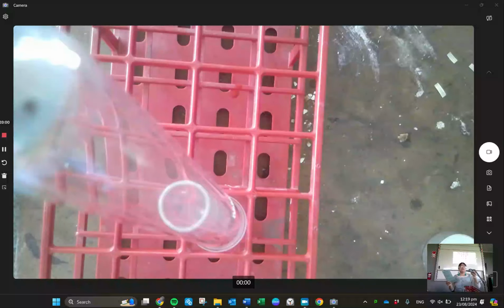So basically we have to figure out, is this hydrogen gas that's being formed, or is this sulfur dioxide being formed? Now, something to keep in mind is hydrogen's flammable. So if this pops, I know it must be hydrogen. If it doesn't pop, then it's sulfur dioxide. Do we see that thought process? I know it's not listed on the sheet, but it is. There we go. You're going to light the candle.